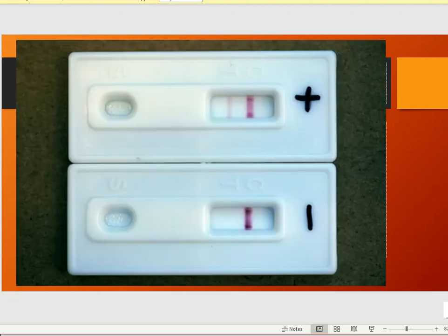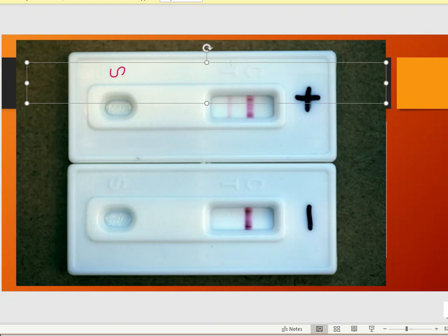What you're seeing on your screen right now is the HemaTrace, and this S area, you can see that stamped onto the slides. That S is the area that you would put your sample in. Your sample typically will be swabbed, it will be put into a buffer, and a drop of this or the Q-tip would be applied to that area. And this would start sucking up that liquid.